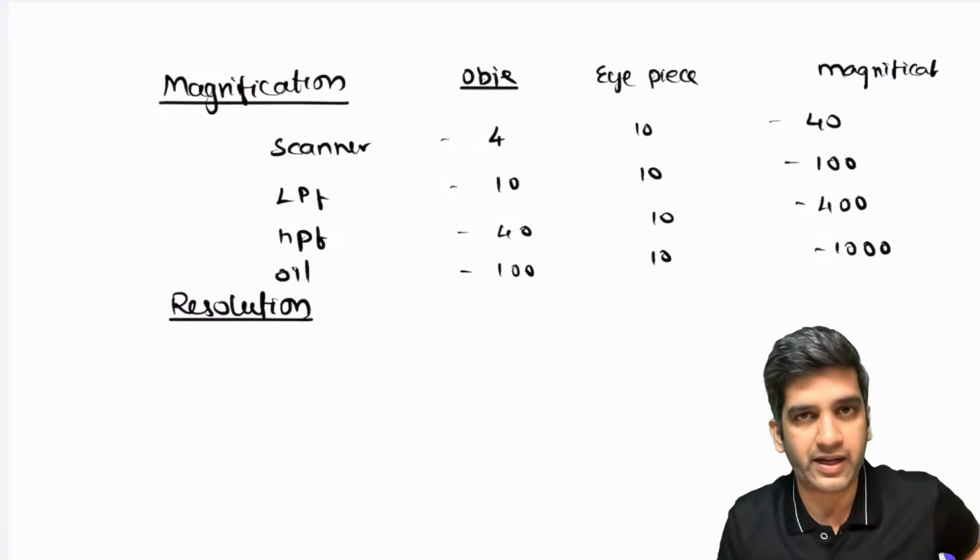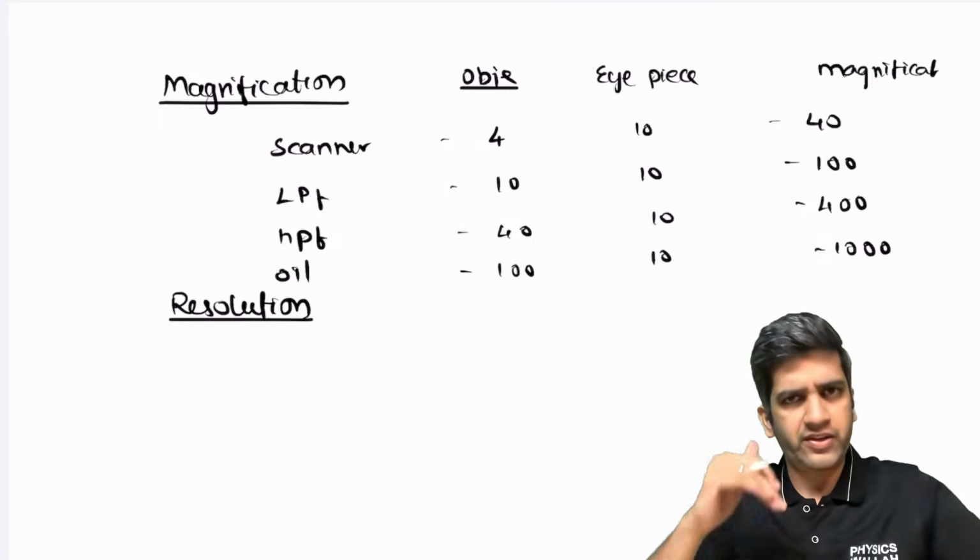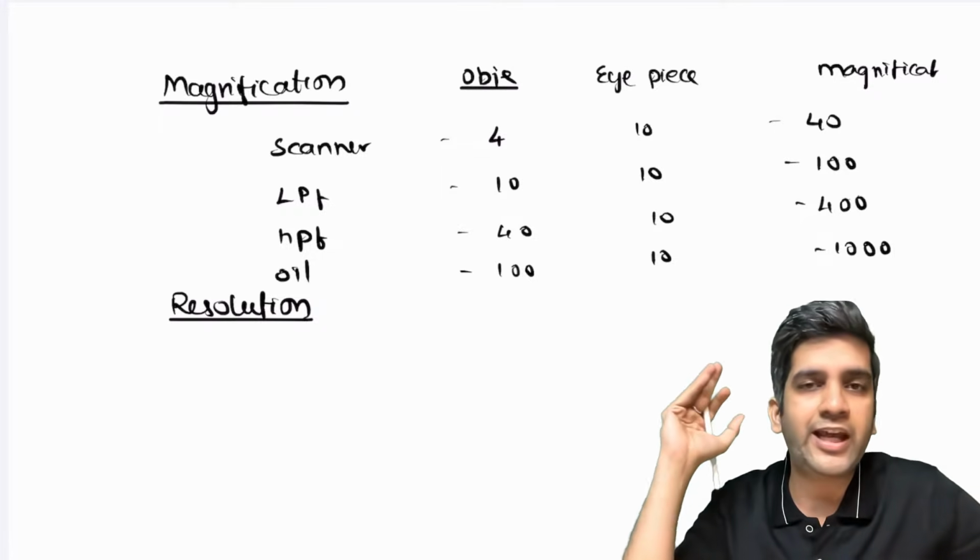Beyond that, I cannot magnify. We don't have the power for a light microscopy to magnify. If I want more magnification, we can go for an electron microscopy.